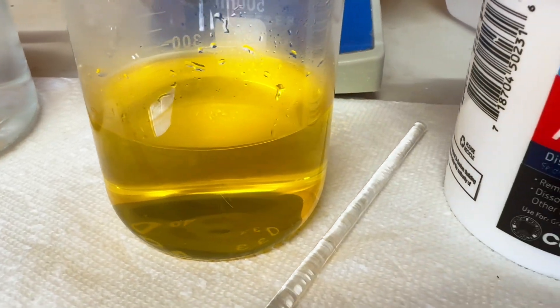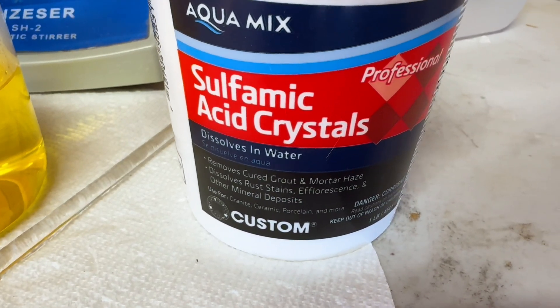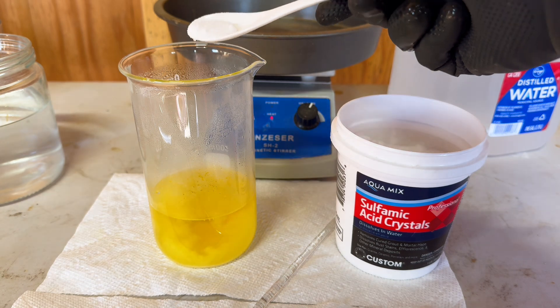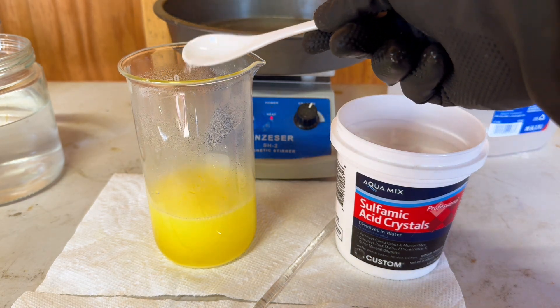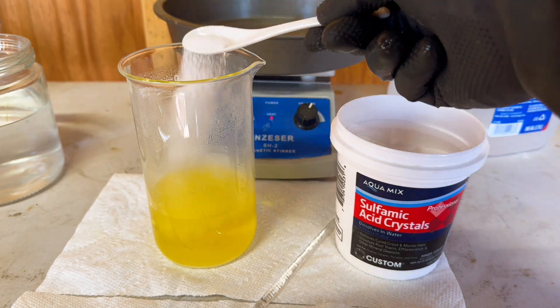We will deNOx — otherwise known as neutralize — the aqua regia using sulfamic acid. I will start with 2 teaspoons of sulfamic acid and I will continue to add some until there is no more reaction from our aqua regia.